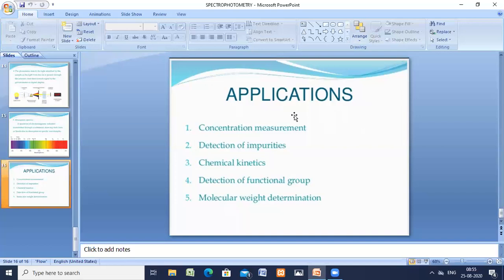The formula of the red compound is written. At a low concentration of KCNS, at 0.1 KCNS concentration, it is one complex, and at very high concentration of KCNS, it is another.